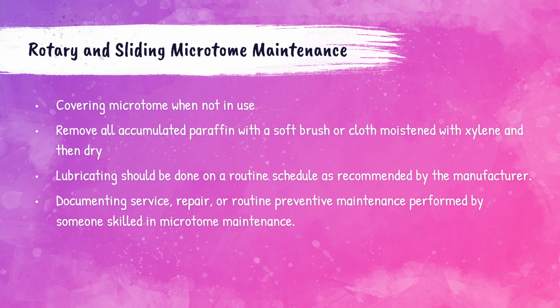And if the microtome requires repairing, someone that is skilled in microtome maintenance should perform that repair. It's also important to note that all service, repair, and routine preventative maintenance should of course be kept documented in the laboratory.